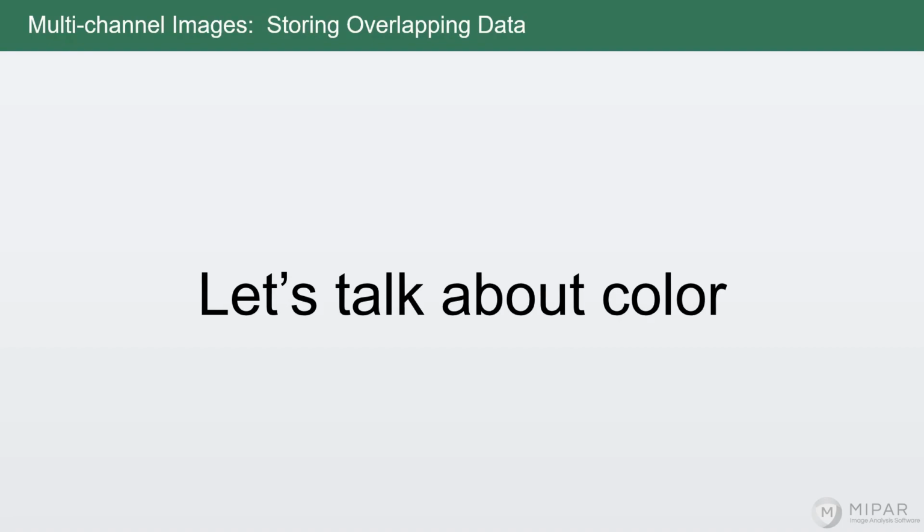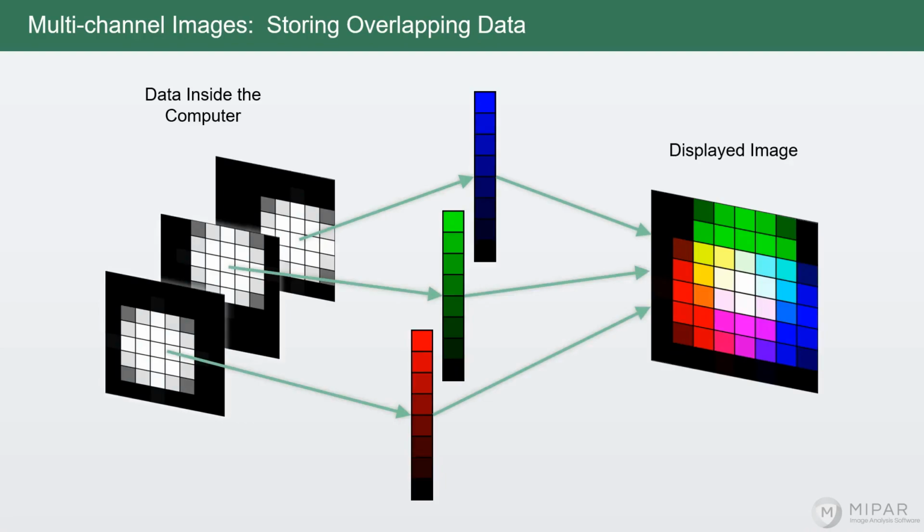So now that we've talked about intensity and we've talked about spatial information, let's talk about color in the image. So if you remember from art class, the three primary colors of red, blue, and yellow. When you're talking about light, the yellow gets replaced with green because those are the three colors that your eye can see: red, blue, and green, if you're not colorblind.